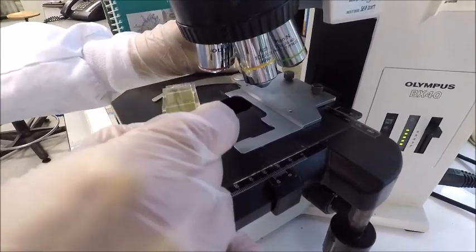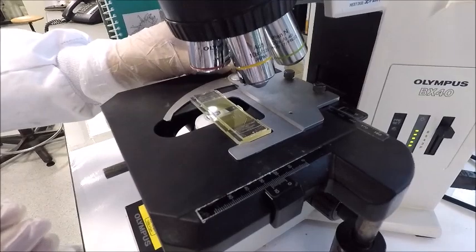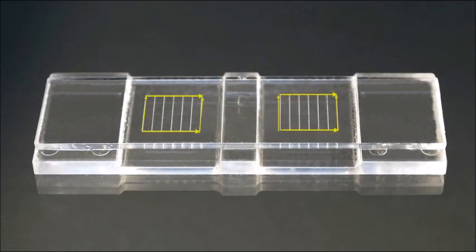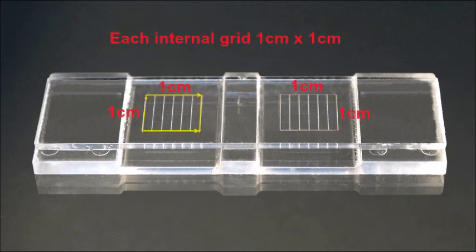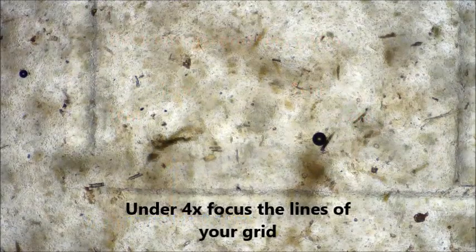Placing your McMaster chamber on your microscope stage, wait 30 seconds to 1 minute and then count the total number of eggs under both of the etched areas. Each grid is 1 centimetre by 1 centimetre ruled, and each side has a volume of 0.15 mL.